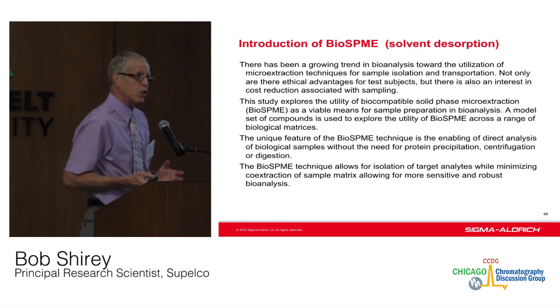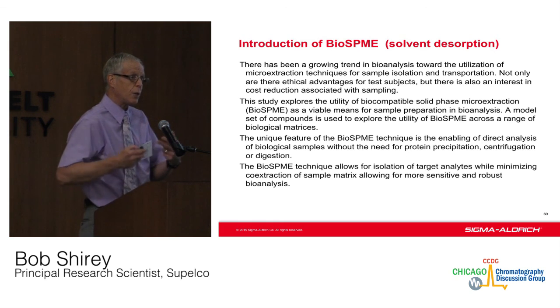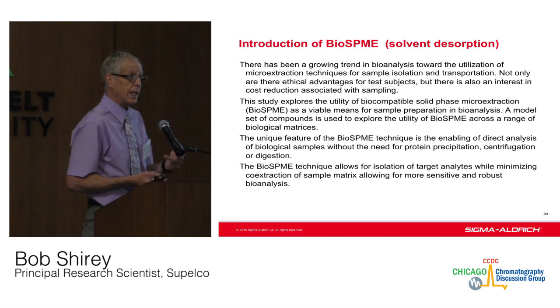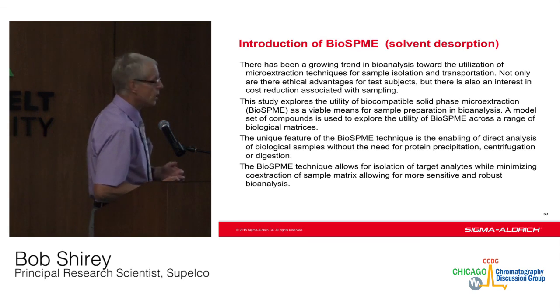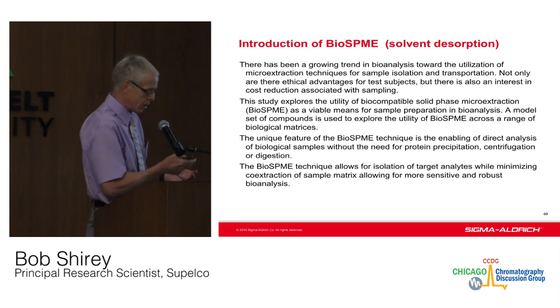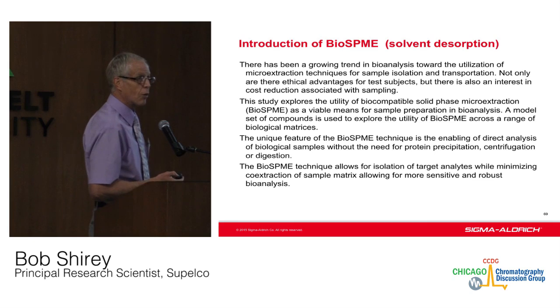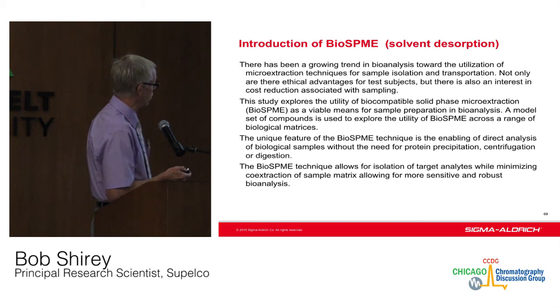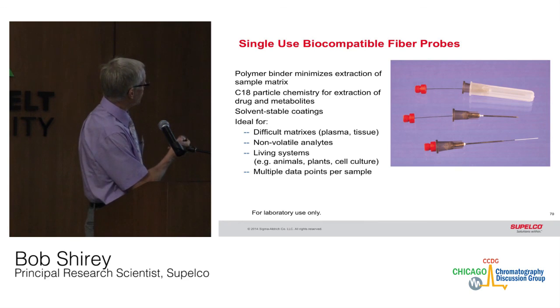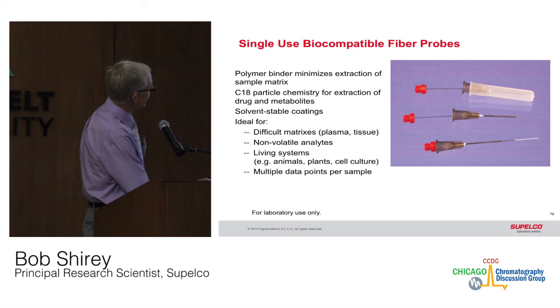But the primary concern with BioSPME is that you can't do multiple analyses with one fiber. Most likely it has to be single use. So we had to come up with designs that were much less costly to produce and allow the person to be able to do single extractions. So we came up with biocompatible probes. As you can see, this is a metal fiber that has been stripped.